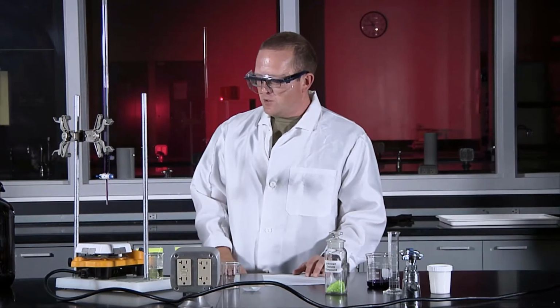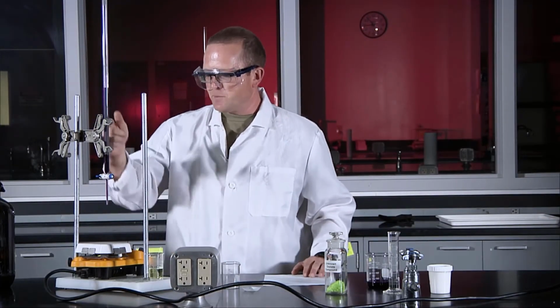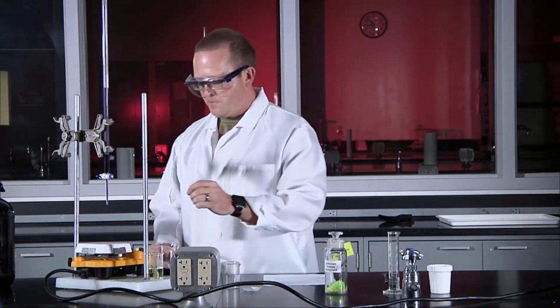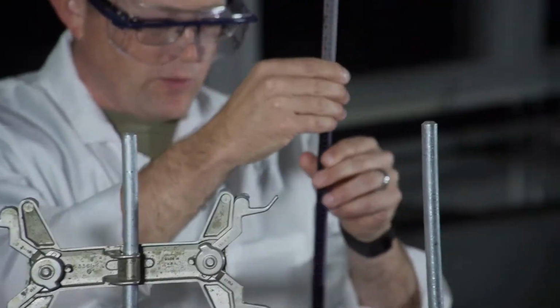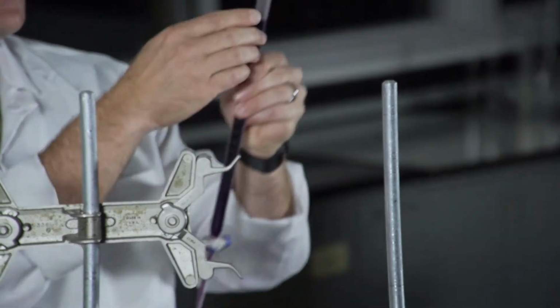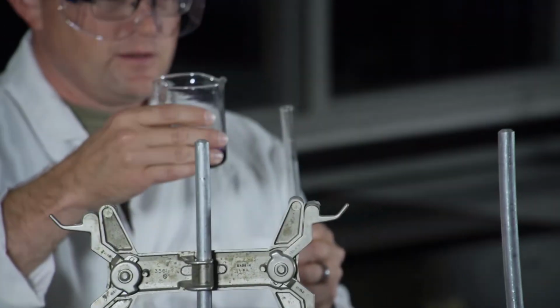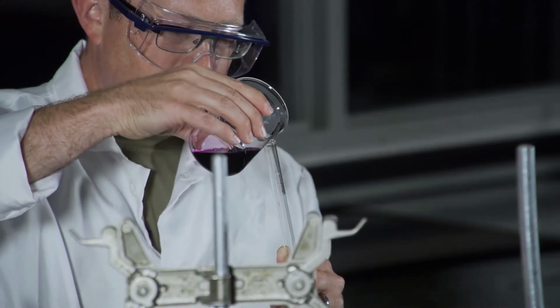So we have our burette. Our burette is partially charged at this point with potassium permanganate, so we're going to add some more. When you're charging a burette, you definitely want to make sure the stopcock is closed, and you don't pour any liquids above eye level. So we'll add some more permanganate here.